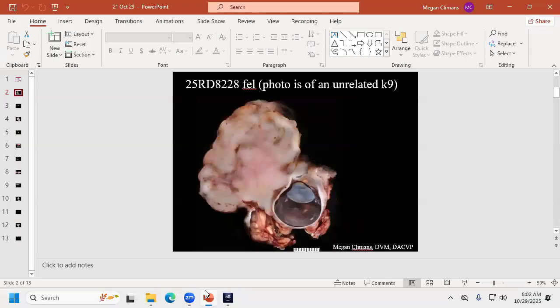We need to switch it over to the scope. All right. Yeah, that TV is being kind of weird. Oh, both of them are being weird. Oh, and maybe it is showing up over the thing. I don't think it matters that much. Ignore our heat haze. Dang it. Oh, I need to have the condenser in. All right. I am on it this morning.